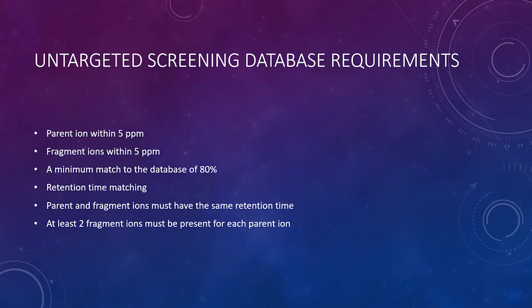Retention time matching. This database I work with has 14,600 compounds. I can't shoot every compound onto the instrument, but I put about 700 on there. And what we do is we report the retention times, and so the other compounds should match with similar compounds of the same class. Like, if you're working with azoxystrobin, the other strobins, which are fungicides, should be of a similar retention time.